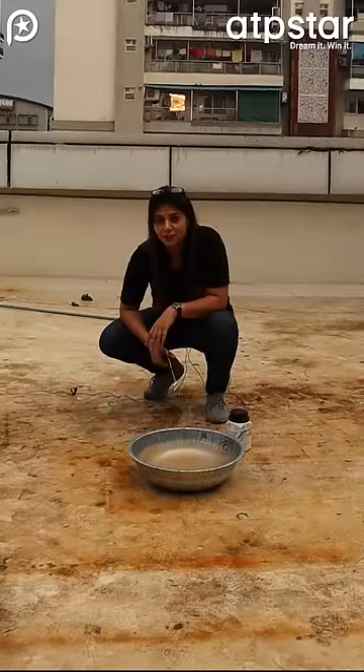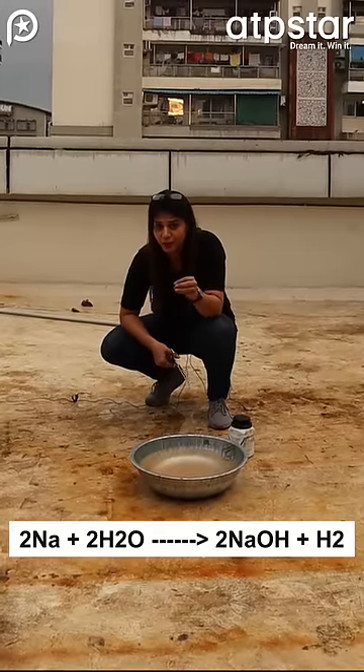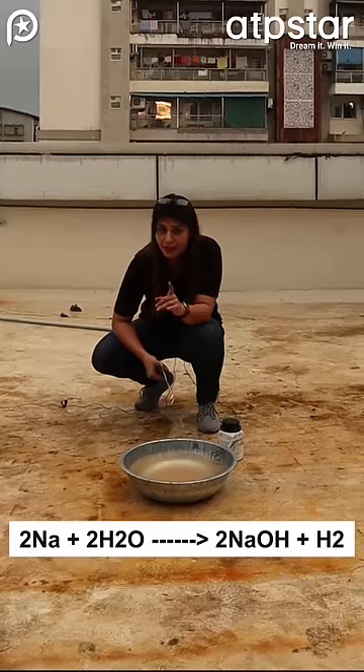Welcome guys. We have a reaction with sodium with water. We will add sodium in the water. The sodium will float a little bit and react. It will produce NaOH and hydrogen gas.